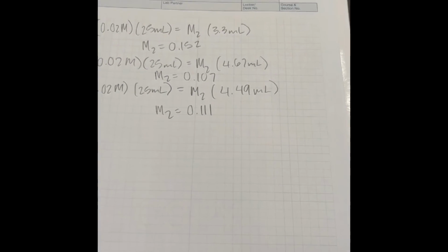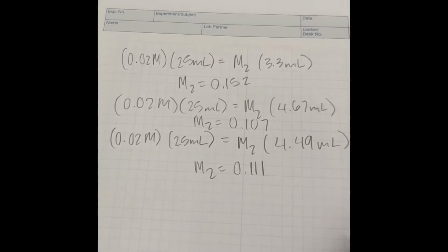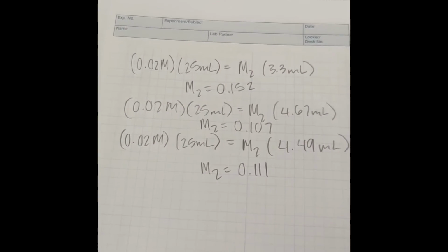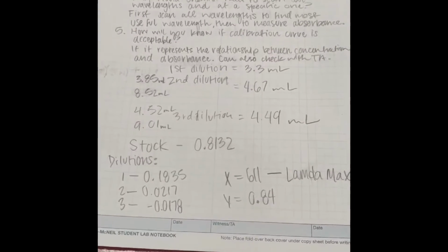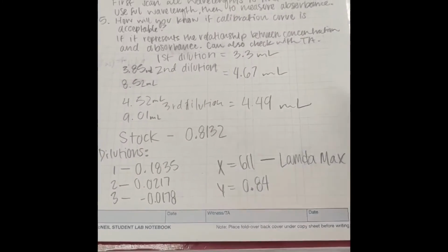Here are the concentrations that we had calculated. Here are the absorbance values we calculated along with the lambda max.